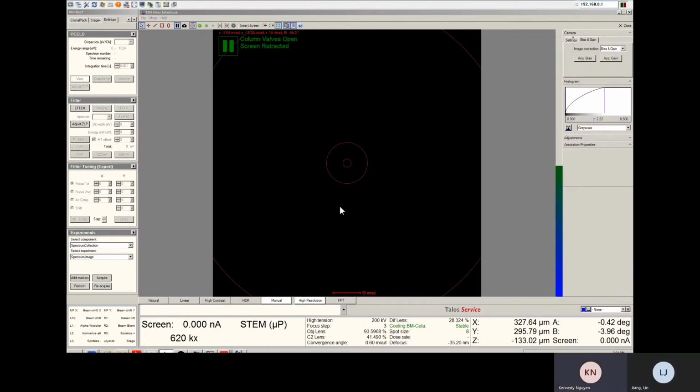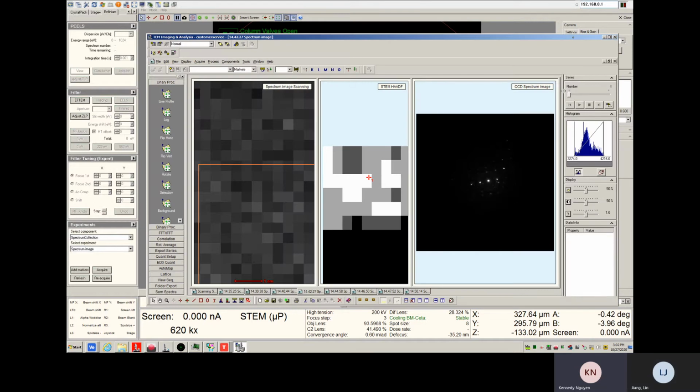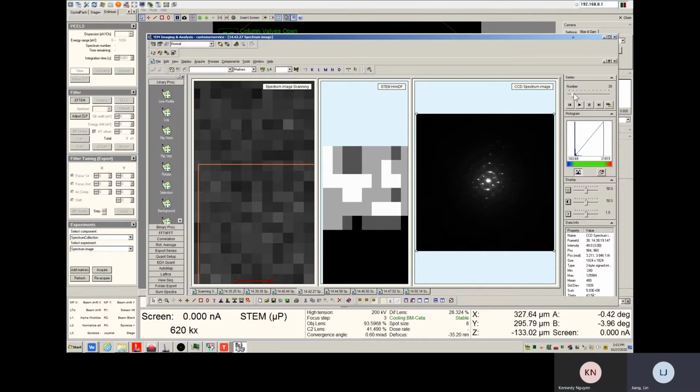Then the image that you get, what kind of file do you get from it? Is it like a stacked image, or could you view it in another software? I don't think so. So you can only view it in this software, right? You can probably view it through ImageJ. ImageJ. Okay. This is the slide bar. You can slide through how many frames you get. So right now I already have 400 frames. You see? So each frame corresponds to one pixel. Maybe there's a way in ImageJ to edit the image for what corresponds to what. I'll probably figure something out.